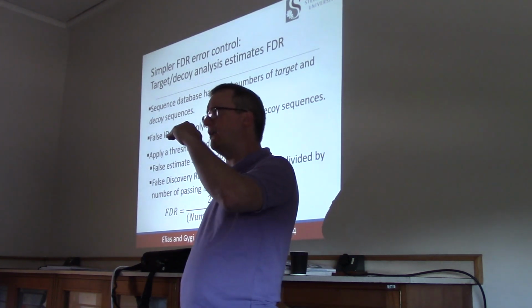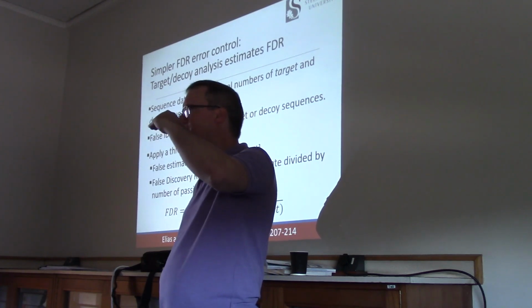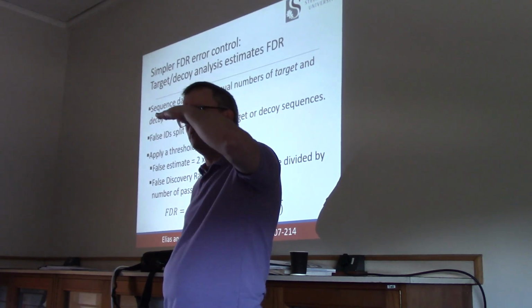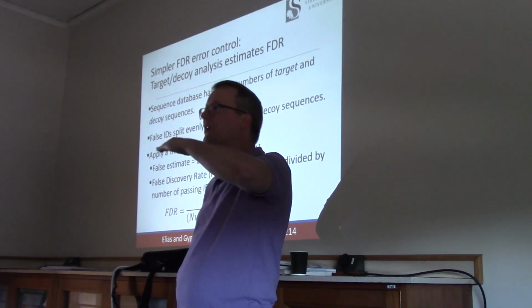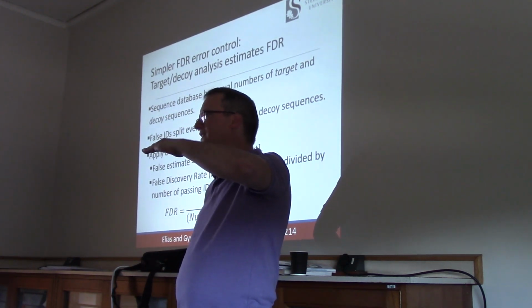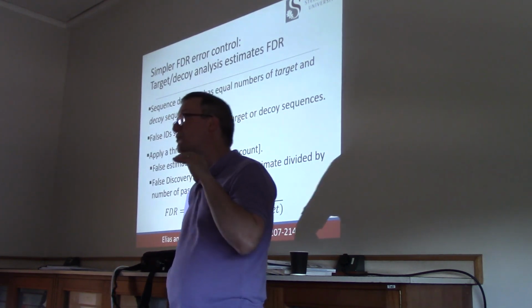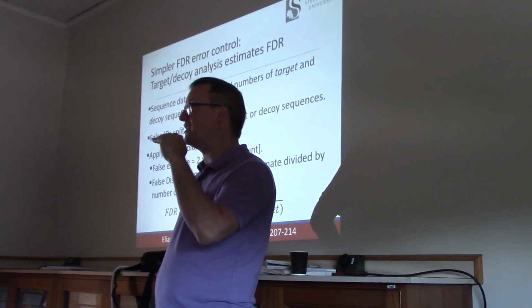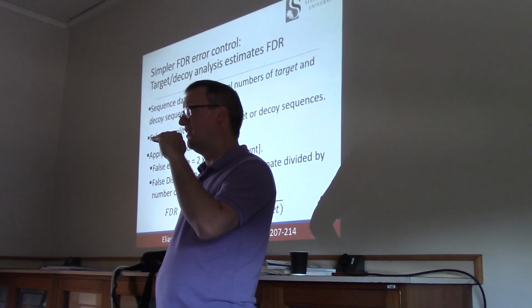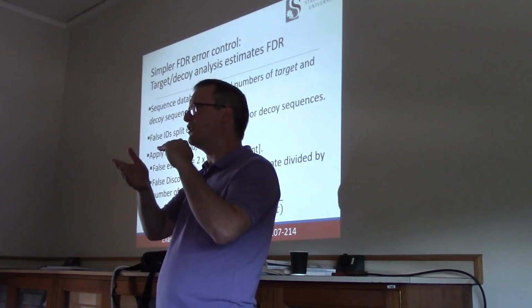Now, if I care about having no false positives at all, I'm going to lower my bar by 1 PSM and say only the best scoring PSM out of this raw file is correctly identified. Now that's nonsense, right? I mean, we wouldn't do that. Why? Now, my false discovery rate at that point is essentially 0, and I've got a great ID, so why do I want to go further?